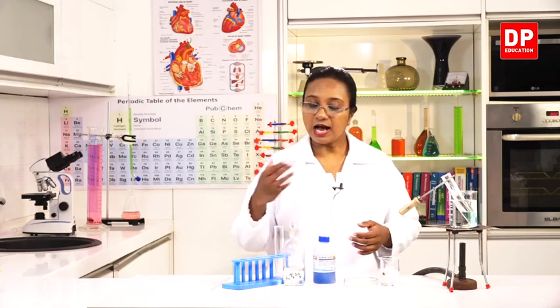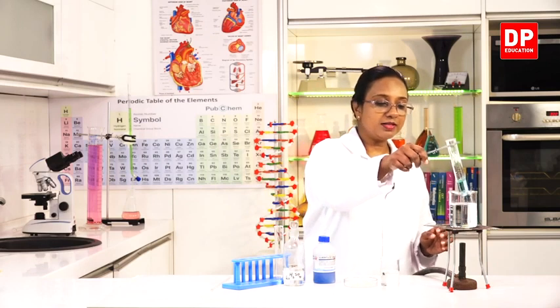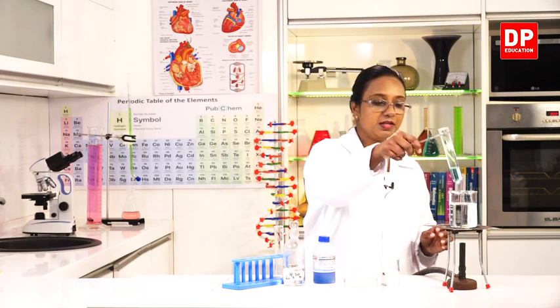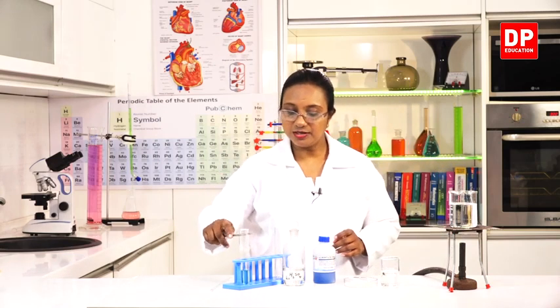So for that, I will again need a freshly prepared sucrose solution. I will remove this from the water bath and I can just place it in the test tube holder. We will just leave it aside.